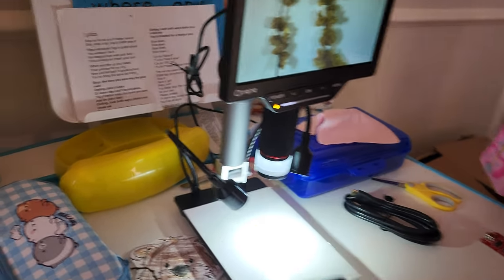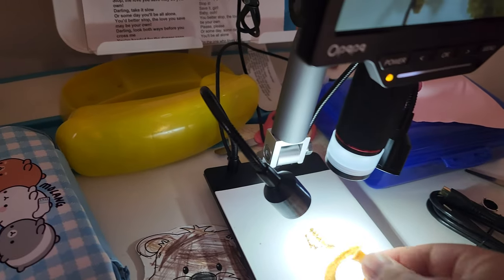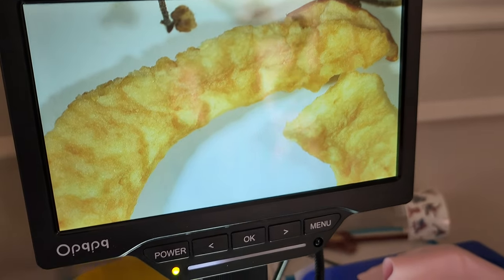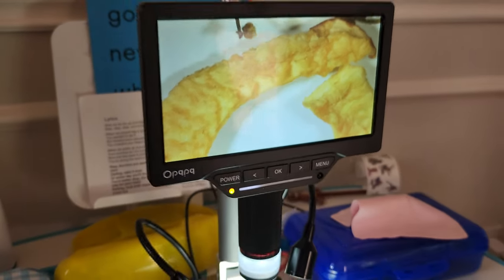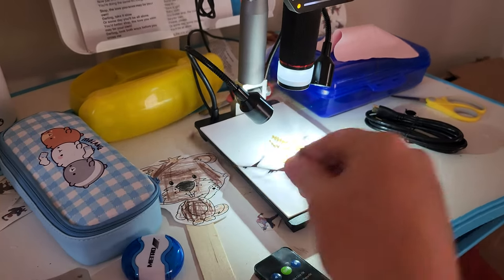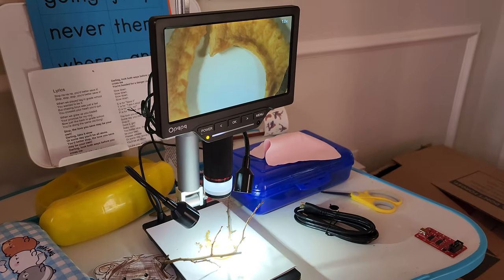We're just going through and — sorry guys, my voice isn't very good today. Everybody knows I've been a little under the weather. But we're showing them like this is a dried apple, and I'm showing them the cell structure of a dried apple on this microscope. What an excellent educational tool. It's so neat, and the fact that it's got the extra functionality of the extra zoom.